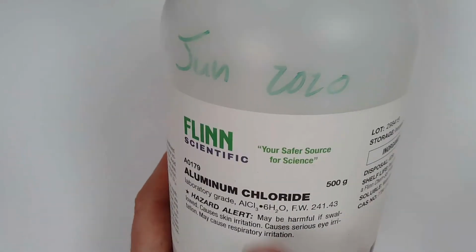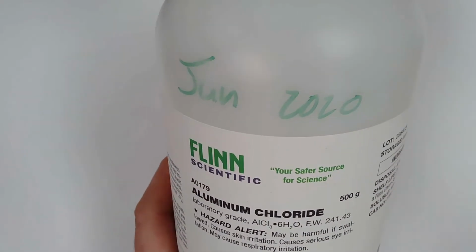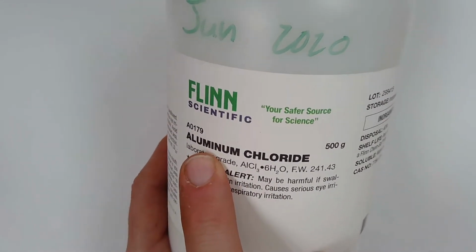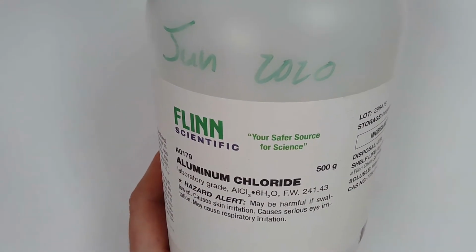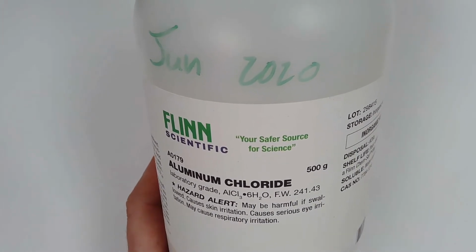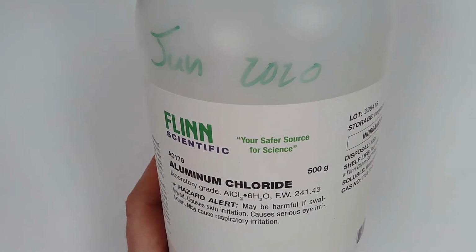Got some aluminum chloride here. I need to change that out for ammonium chloride. I grabbed the wrong one. Aluminum chloride is not going to work for us, but I'll change it out. So this will say ammonium chloride instead of aluminum chloride. Actually, for a second, what would the formula of ammonium chloride be? If it's not this, it would be what?